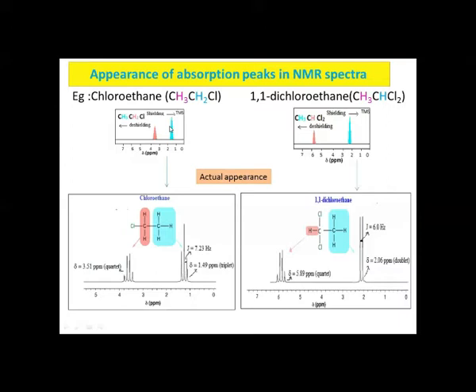But in addition to knowing where the peaks are on the chemical shift scale, and what influences the chemical shift value, one must also consider that the peaks in an NMR spectrum are not always a singlet. In this example molecule, as we said, there are two kinds of protons in it.